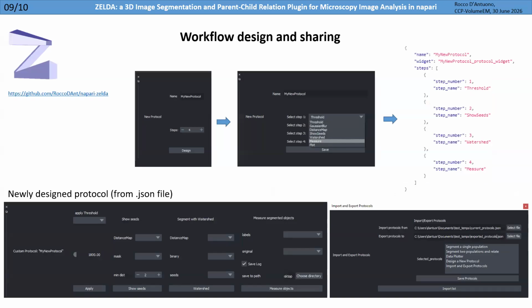We mentioned that the different blocks of the software can be accessed in a database, and eventually one can try to develop what I defined as a protocol. That means a part of the graphical software, and try to combine these different graphical components.